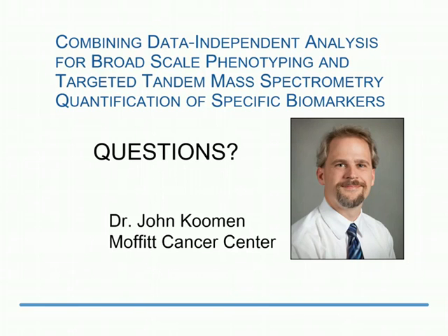We actually have activity-based protein profiling data sets using this, so that's not really post-translational modification, but it is chemically modified peptides. And the nice thing about that is we're trying to enrich specific types of peptides, and so that's why I think it's actually a fairly good model for post-translational modifications as well. If you enrich a specific class of peptides, I think this strategy allows you to see a little bit more detail than a standard DDA experiment.